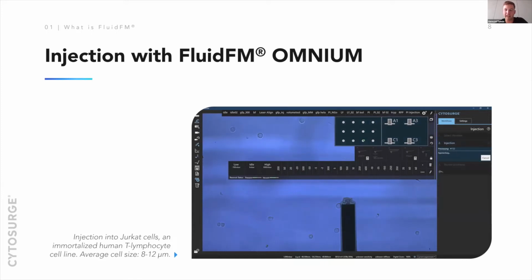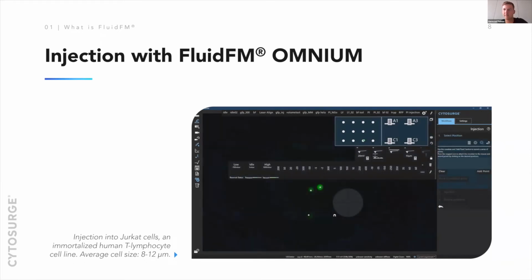This is how it looks like in the microscope as the whole manipulation is being done. We can follow it in real time, and you can see the cantilever kind of squishing these cells. And after the squishing, a positive pressure is applied, and then this fluorescent liquid is going to enter the cells. And when we switch into the fluorescence mode, then you will be able to see that indeed the material made it into the cell.